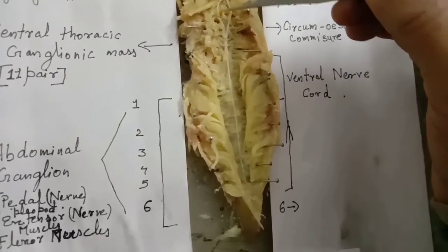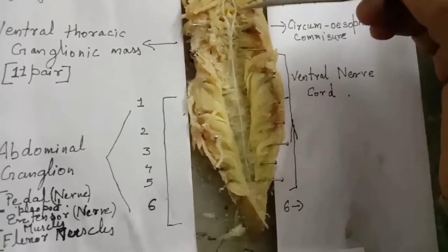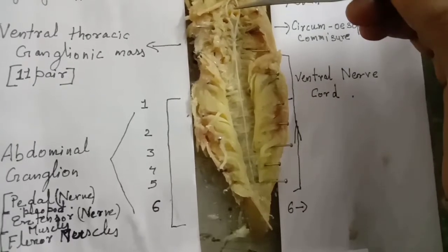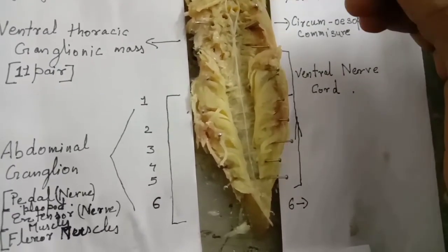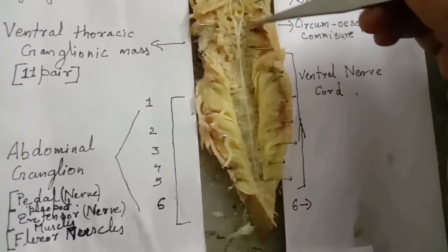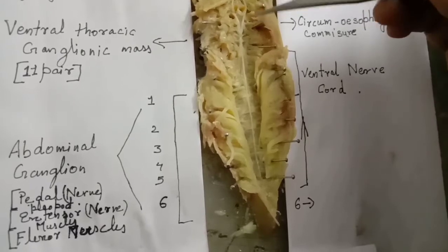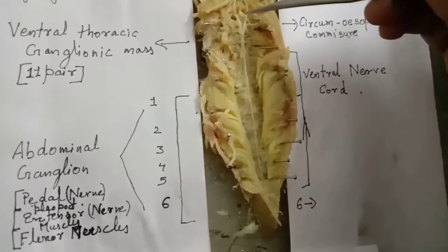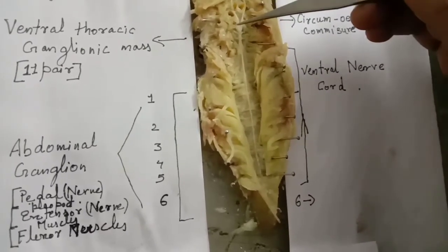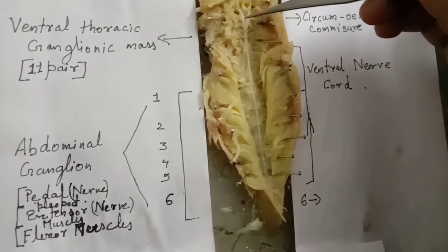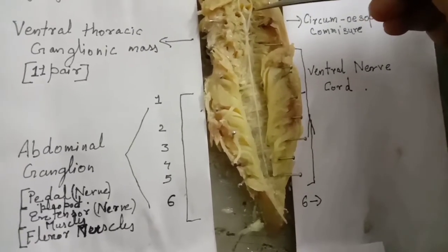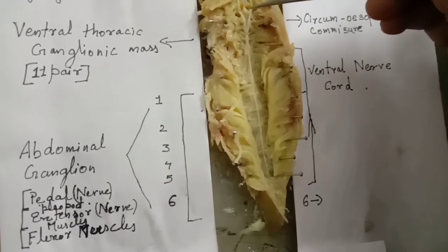Next is the circumesophageal commissure. The brain gives rise to a pair of thick posterior circumesophageal commissures which surround the esophagus and unite together ventrally with the subesophageal ganglion. A transverse connective joins the two commissures.